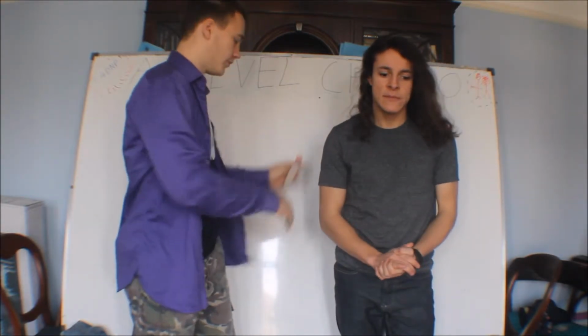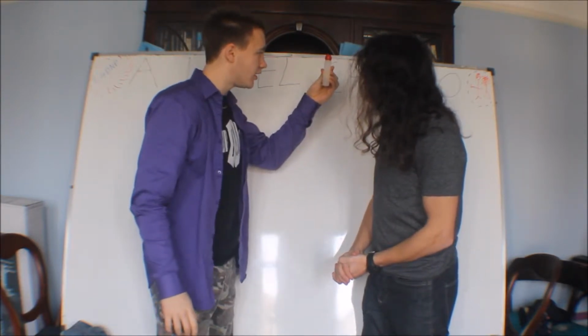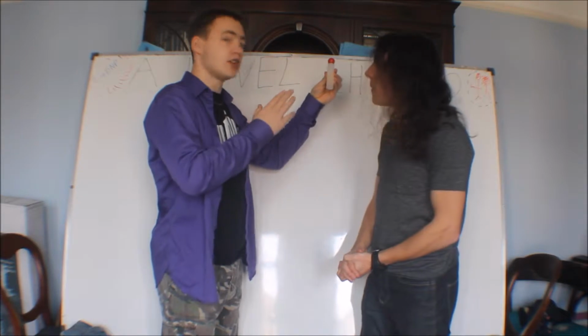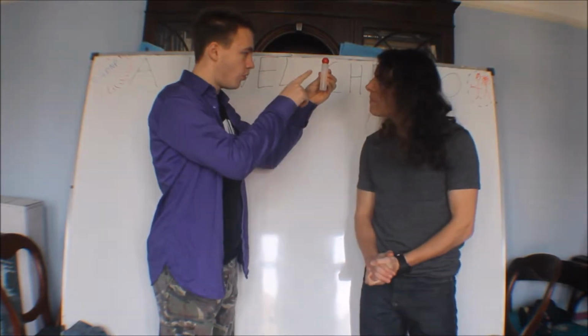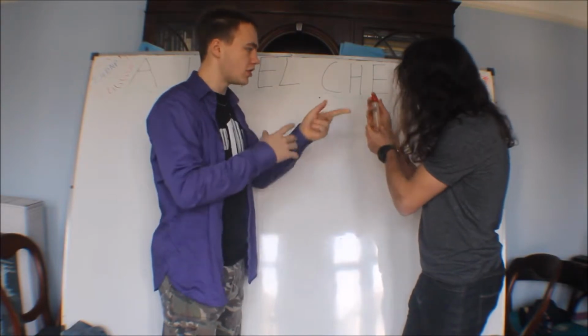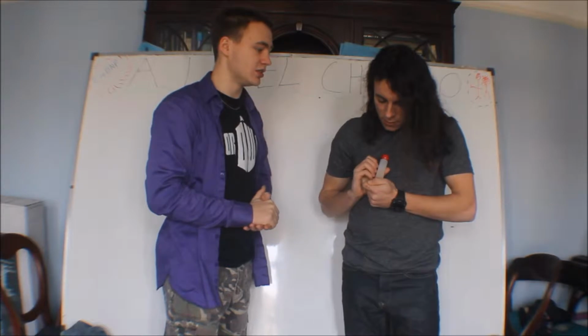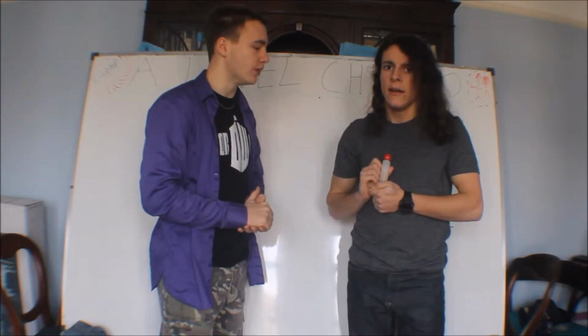What we've been given is this. This tiny little thing. And you see the liquid in it? I do. What we've been asked to do as our challenge is to find out what that is. We're running some tests on it, some chemical analysis, and we've got to determine what that is. The only clue we've been given is that it's an organic compound, which is a huge field of what it could be.